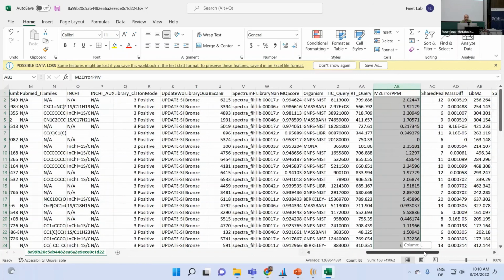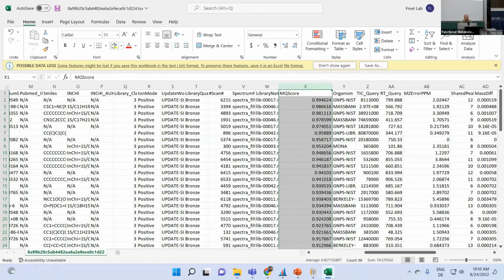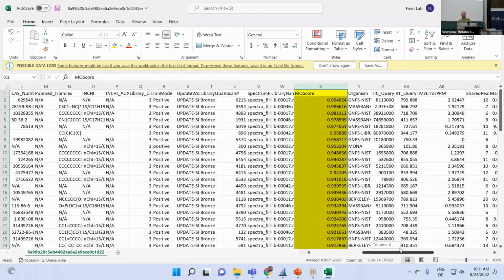And then obviously the cosine, which here is now called MQ. Again, apologies for the confusing naming, but due to historic reasons, it was hard to change that and make it uniform to cosine or so. So here it's MQ.